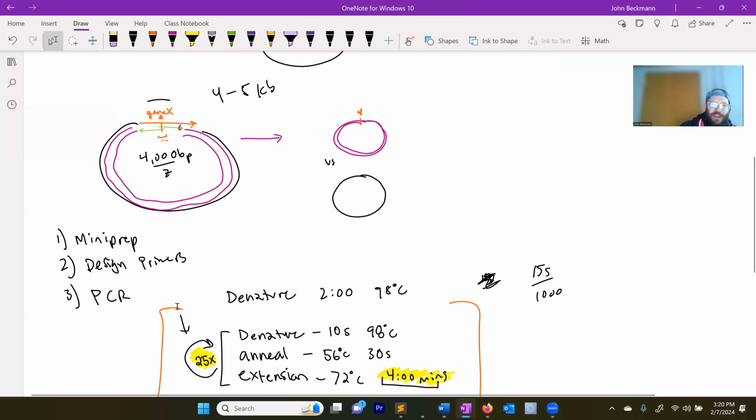Okay. So you run this PCR and it's going to give you a tube. In that tube will be all your PCR reagents, plus this new synthetic, mutated plasmid, and your template, okay? So you have this tube, which is a mixture of the mutant that you synthesized and the old template, which is the old thing that you don't want anymore. So now you have a conundrum: how do you recover just the mutant one, but not the wild type original template plasmid? So the recovery process involves a transformation step.